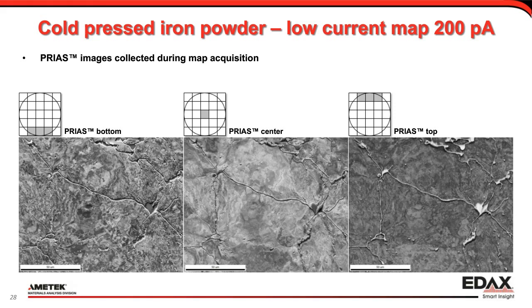But if you look at the image, what it does is we use the EBSD pattern, and then we take a section of the phosphor screen, or in this case the chip, to extract the intensity at that part. And we're not trying to index anything, we're just using it as an imaging detector. And when we are taking the intensity at the bottom, we can get a beautiful picture, very similar to an FSD image, a forescatter detector image, but with the difference that this is background corrected. An FSD image just shows the raw signal.